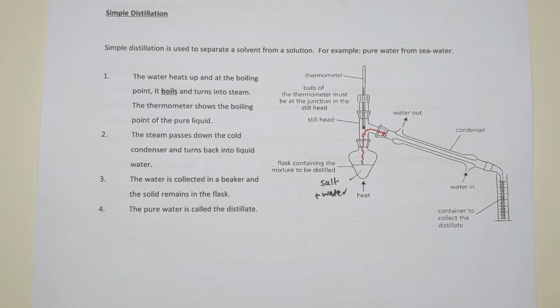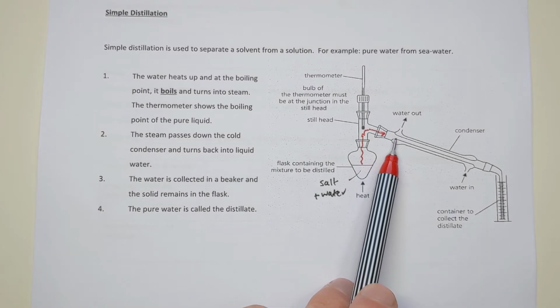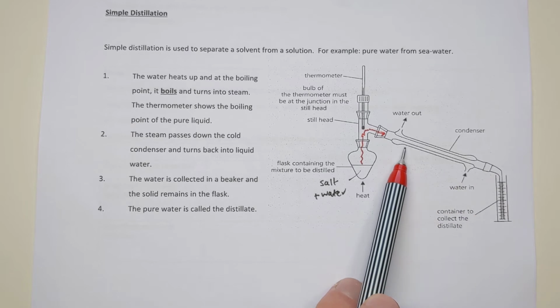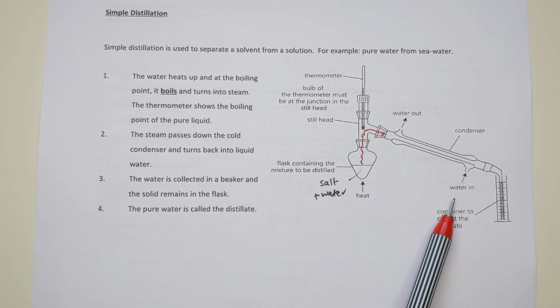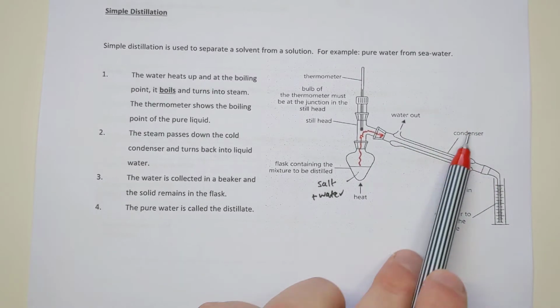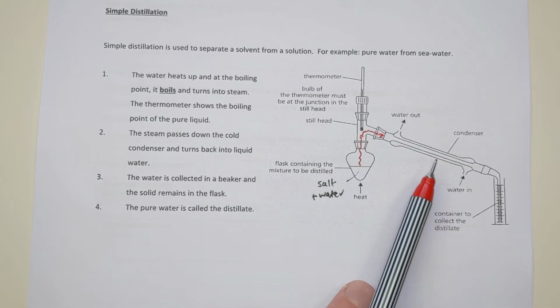How we make it cold is we pass cold water from the tap around the outside of that tube. So the tube is hollow, the steam can pass through it quite easily, but there's like a little jacket around the outside of this tube with two holes in and out. I put tap water in this hole, it flows through that jacket and comes out the other side, so I'm constantly cycling more through this container and keeping it nice and cool.